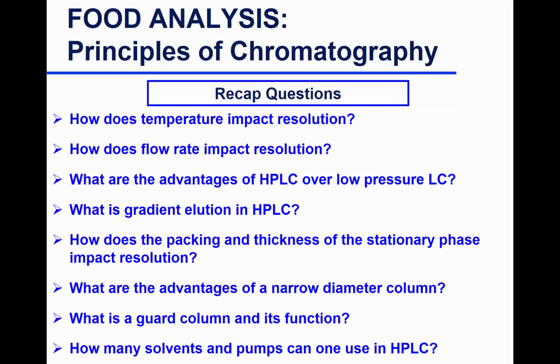All right, so how does temperature impact resolution? Remember what we talked about when you guys were doing the HPLC lab? Volatility.